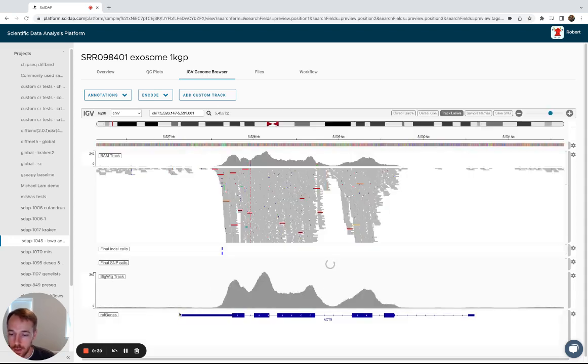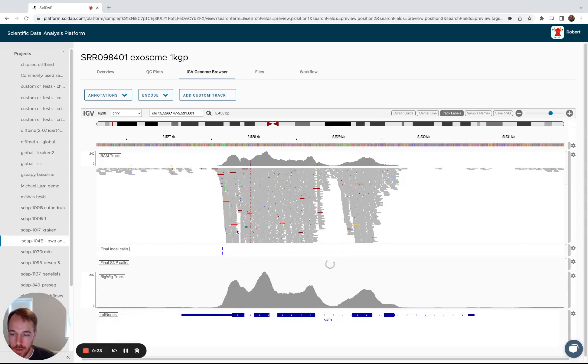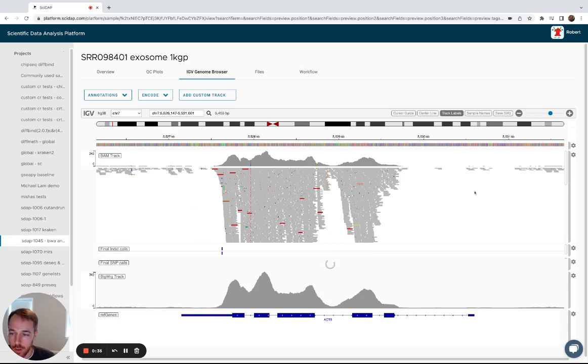Down to individual gene annotations, and then you can see the actual base calls here, and then the final indel calls and SNP calls along the genome. And here the SNP calls are still loading. Give that a second.